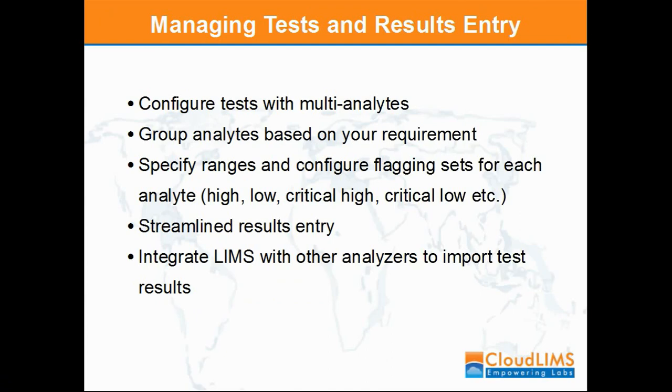Different testing labs report different analytes based on their specialization. Usually the outcome of a single experimentation provides a multitude of analyte values. The accurate reporting of the analyte values is crucial as the future course of action is determined based on these values.